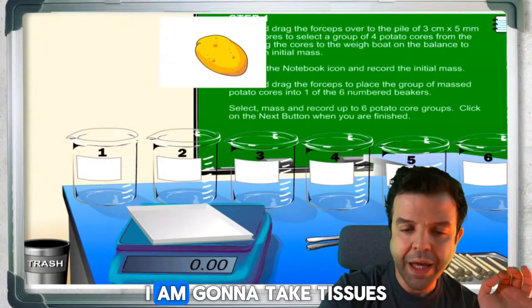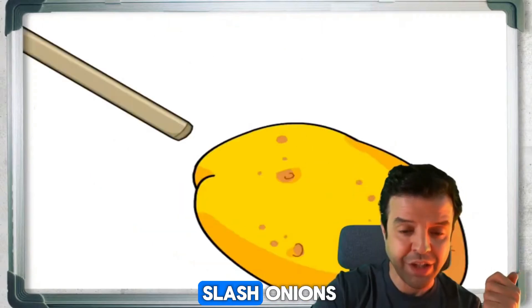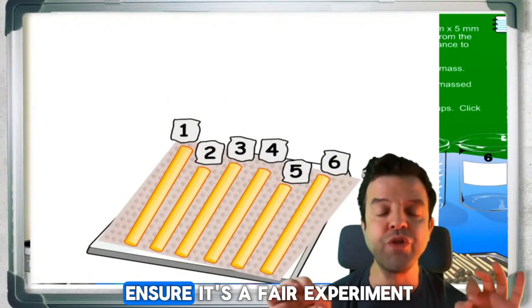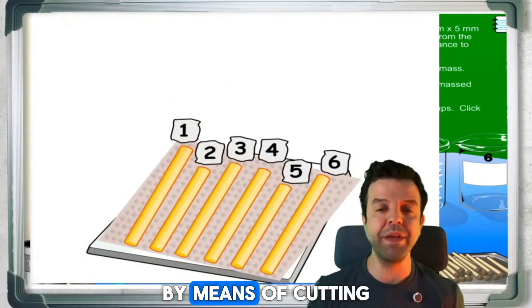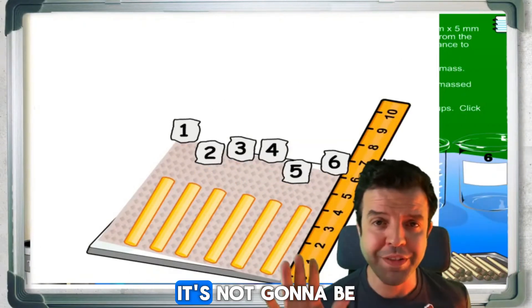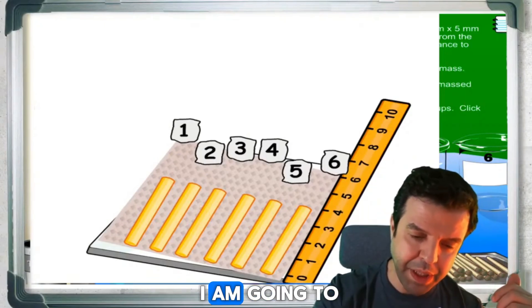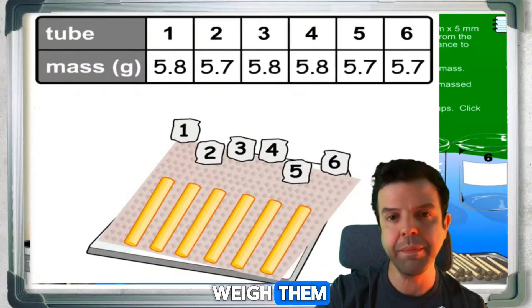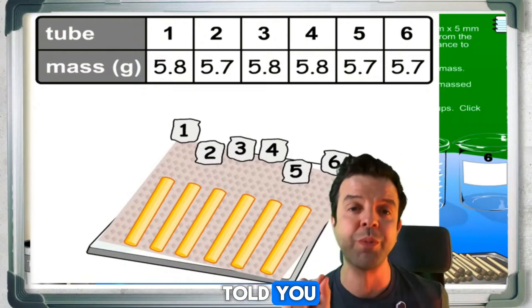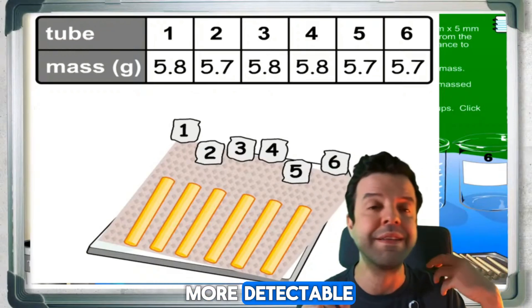We're going to take tissues — usually we use potatoes or onions — and cut them into cylinders. We ensure it's a fair experiment by cutting them all the same size. Now it won't be perfectly identical, but still good enough. I am going to weigh them, because weight is a better option here than measuring size, as the length won't be perfect and changes in mass are more detectable.